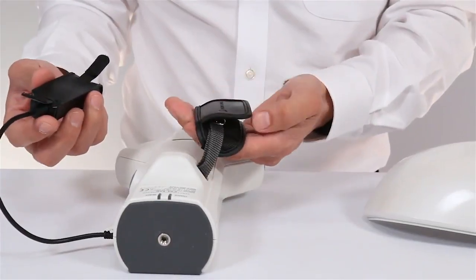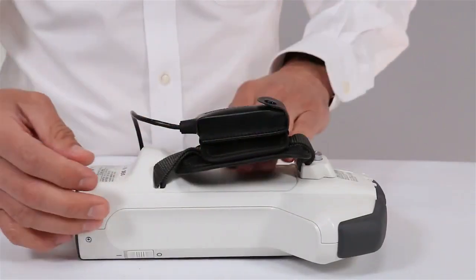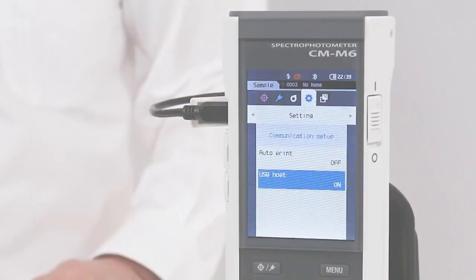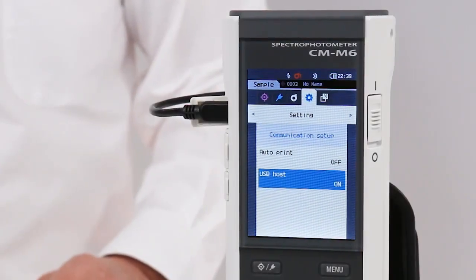To take measurements even further, optional Bluetooth support will send data to remote devices over wireless connections.